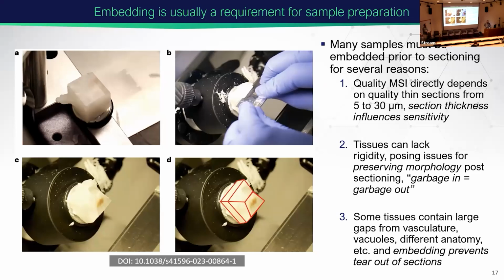In my opinion, sample prep is the first step in the entire mass spec imaging workflow, and all your downstream analysis depends on that step. So you can have all the fancy techniques and bioinformatic tools, but if you don't prepare your sample well, the data that you get will not be valuable and representative of what is really going on in the system that you investigate.